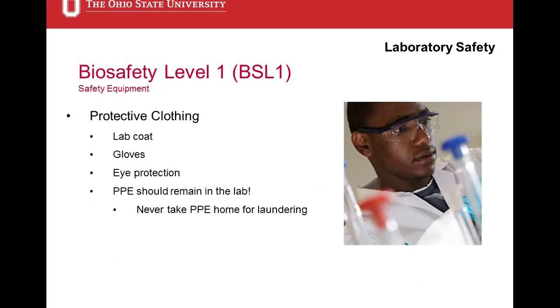If you have a spill onto your lab coat, it either gets sent out to an approved cleaner for laundering, or it can be cleaned in the lab. If it's a biohazard spill, it can be cleaned in a lab sink with bleach. If it's a chemical spill, we recommend that you just dispose of it as chemical waste and get a new lab coat.